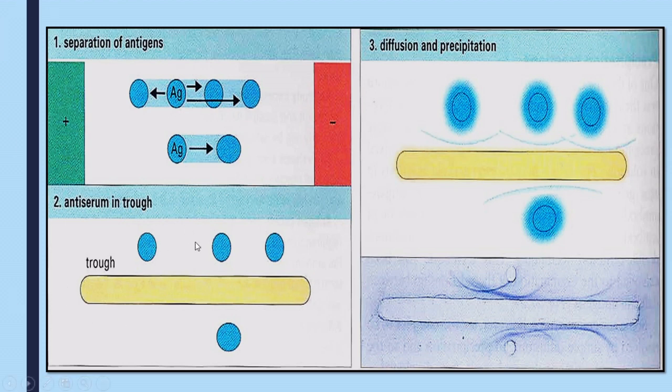So now you can see in this antigenic mixture, you had three components. In this antigenic mixture, there was only one component, which moved towards the negative electrode. So this was positively charged. This is negatively charged, and this is positively charged. Also, their size will make them run through the gels at different rates. And this is where you can see the actual arc seen for each component.